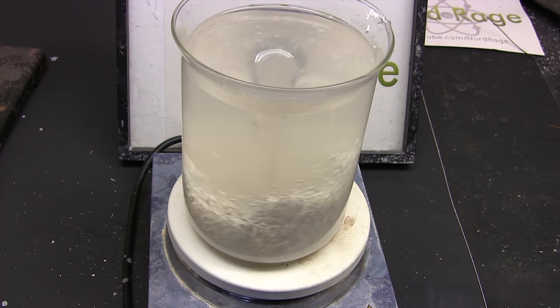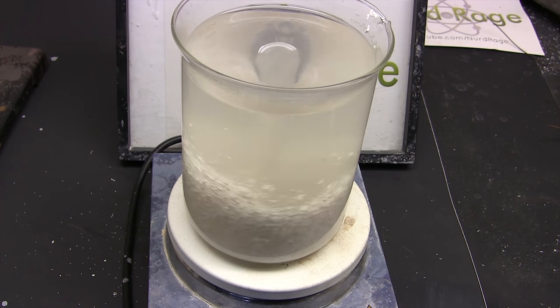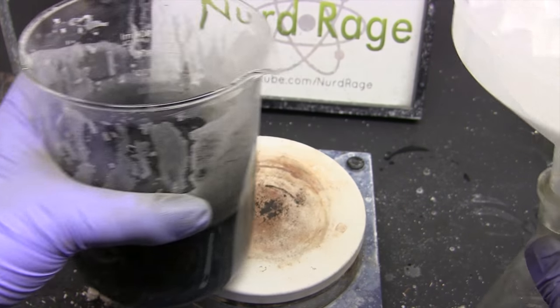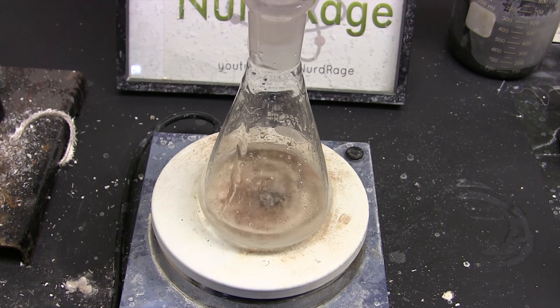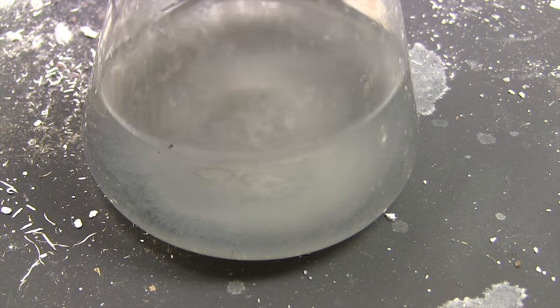Assuming other methods like trying different solvents, temperatures, or performing reactions to alter one can't be used, you're going to have a difficult time. If the chemicals you're trying to separate only dissolve slightly, then you'll need huge amounts of solvent. It might take thousands of liters of expensive solvent just to leach out 1 gram of chemical. Additionally, if the solvent isn't perfectly pure, it can add its own impurities to your process. If you have 1 milligram of impurity per liter of solvent and you're using 1,000 liters, then you've just added a gram of impurity to your product.